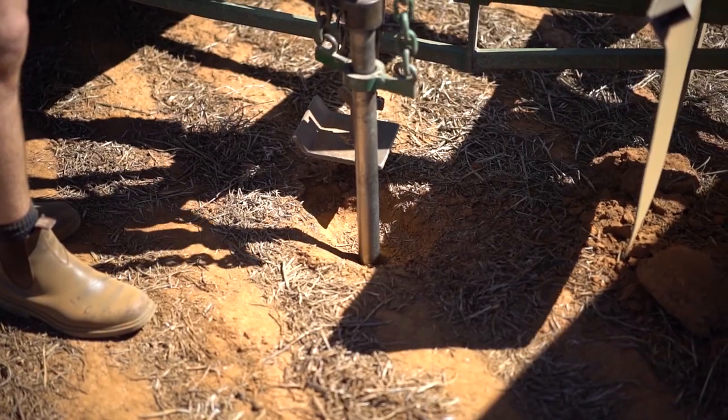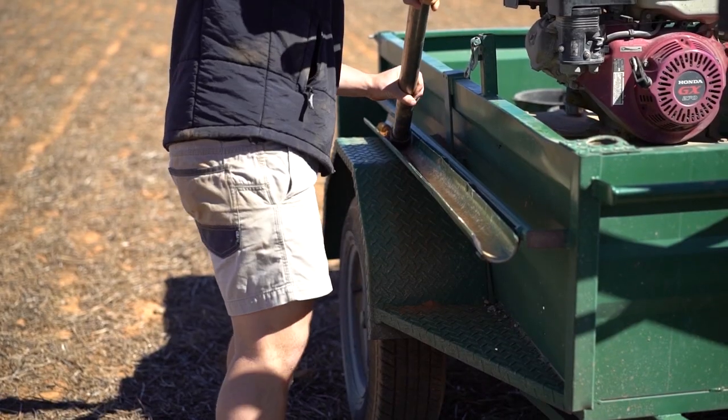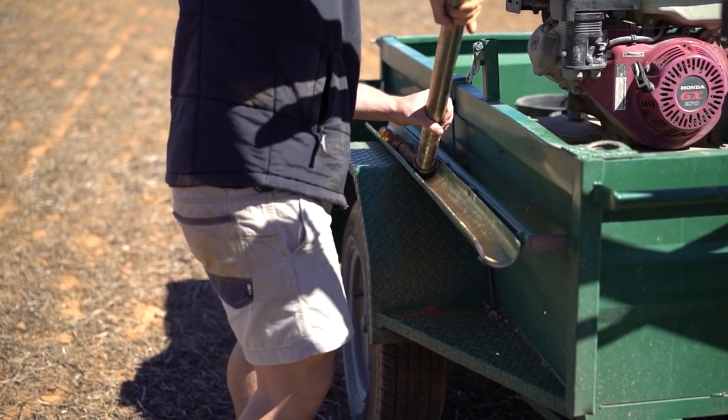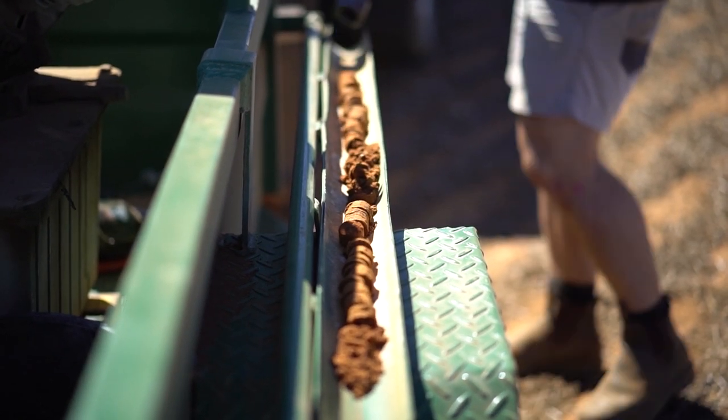We put our deep core into the ground and then we can roll it out onto a PVC pipe or something where we can accurately measure the segments. For this project we're doing 0 to 10, 10 to 30, 30 to 60, and 60 to 90. We're taking six deep cores.